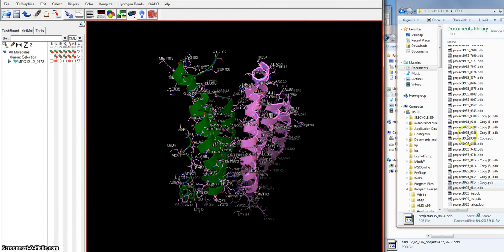Fortunately, with this run in PyDock, the MPC2 chain, because it was loaded up as the receptor, and then MPC1 as the ligand in the context of that web page, the MPC2 aligns just right.